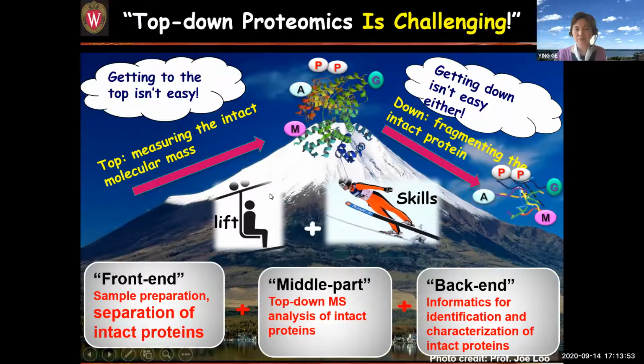And the skills means train students. So the trick is, I always say, when students are in their first year, don't have them do bottom-up, get them to do top-down so they don't have any fear factors. And they would think, oh, okay, top-down is pretty easy. That's because from my own experience, when I started my graduate school in Fischer's lab, we were not allowed to do bottom-up. So we naturally got used to doing top-down proteomics experiments.